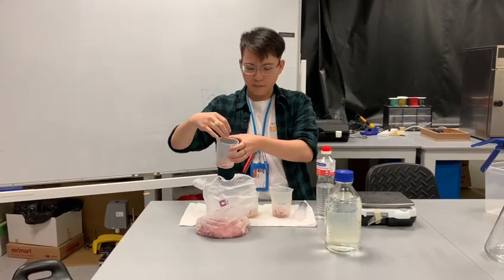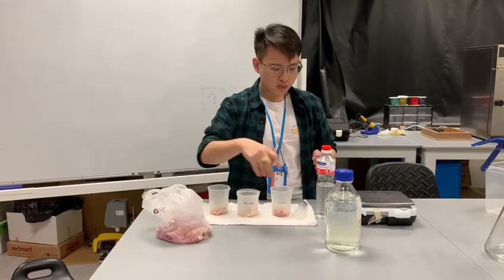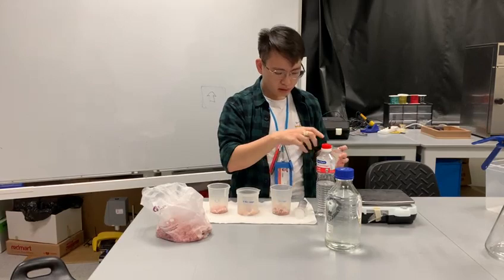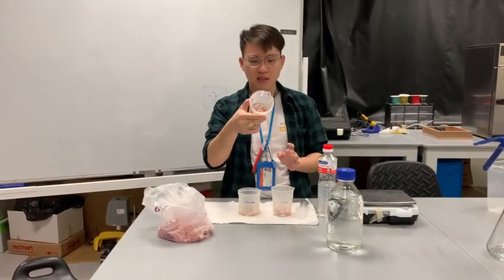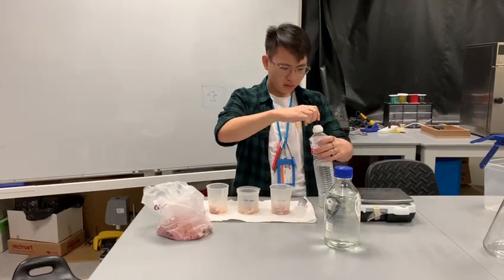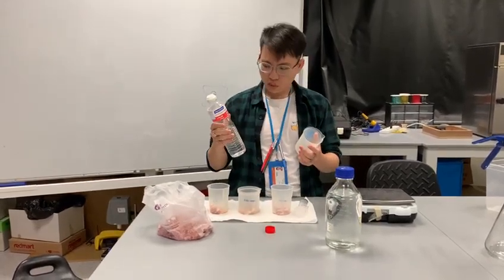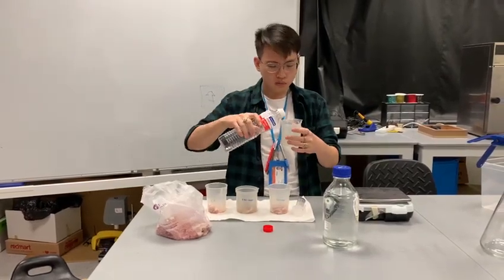Now, we'll be standardizing the volume that is being used. I will just use this to measure 100 cm3. Ideally, it should cover all of the eggshells inside. So, I think I'll use 200 ml. 200 ml? Yeah, 200 ml.